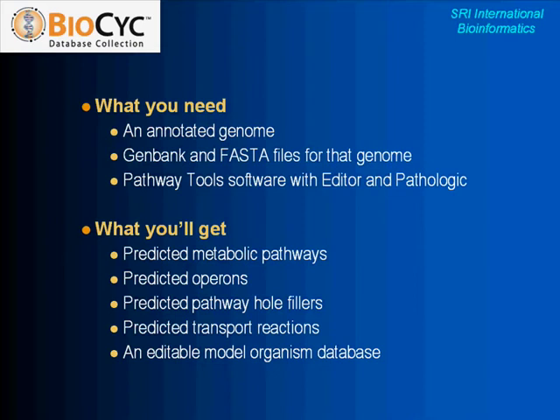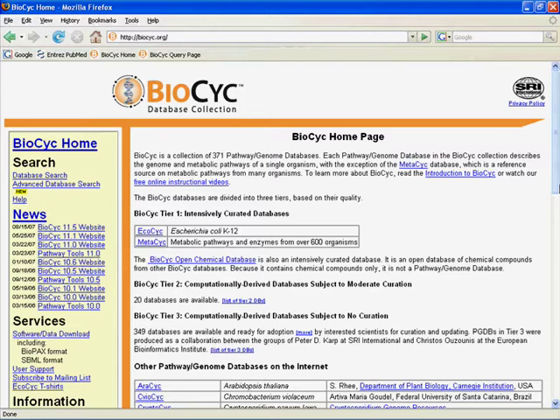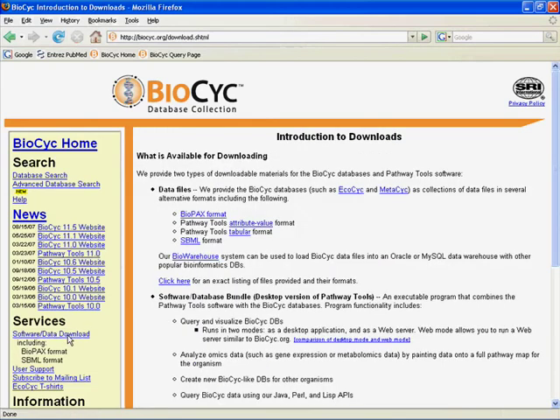Let's take a quick look at the website. This is the BioCyc homepage, and if you're interested in finding the software download, you go down on the left to Software Data Download. Just click on that and it will bring up information about what you can download — everything from flat files containing the data, to the full software setup you'll need to make your own model organism database using Pathway Tools. All the information is right there, and you can email us if you have any questions. Right now we have versions available for Unix, Linux, and Windows machines, and we've successfully run the Windows version on dual-booting Intel Macs also.